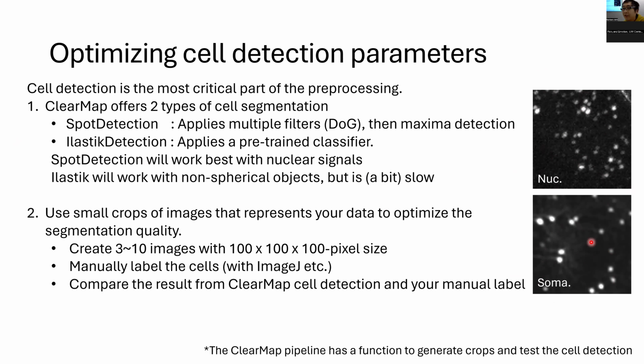These are both imaged with the 1.6x objective, but you see some of these dendrites really mess up the segmentation. Especially when there are a lot of dendrites, very dense, they will form this very strong signal and be artificially found as a cell kind of object.